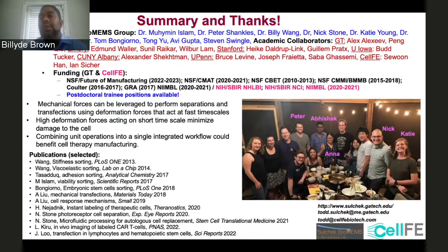Yeah. So, as far as I know, for clinical products, the only time electroporation, which is the main manufacturing tool besides virus, is used is with what's called genetic knockouts. So these are when you can disable a gene by cutting it using, say, CRISPR-Cas9. The more important application is delivering a gene and inserting a gene. And that can require a Cas9 cut, but you also need to supply the DNA template.